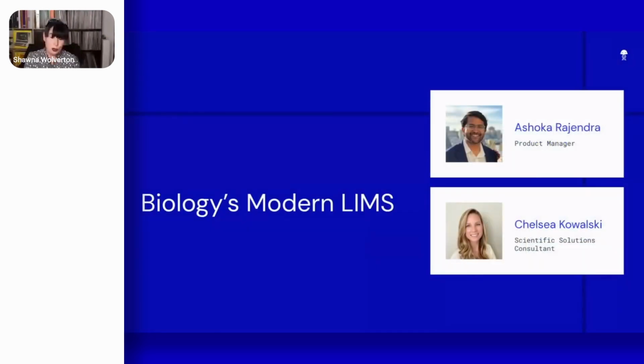And I may be new to Benchling, but as I've spent time with customers over the last few months, I have constantly heard that we're all still struggling with really sharing the important information and finding the scientific and operational data we need to do great collaboration. And while I am new, Ashoka, our product manager for our development products, is clearly not, and he's been having these great conversations with customers for a while. Ashoka, tell us a little bit about what you've learned.